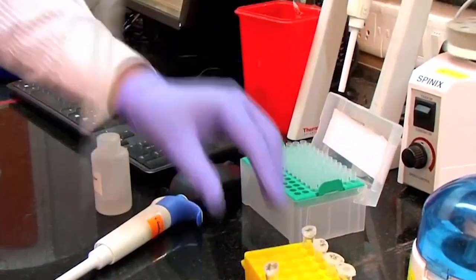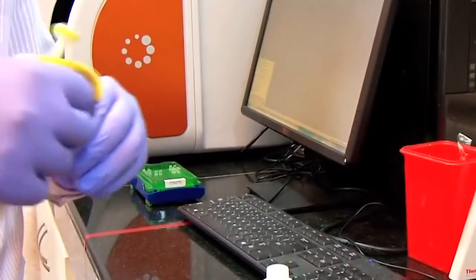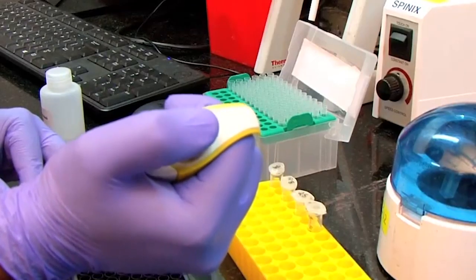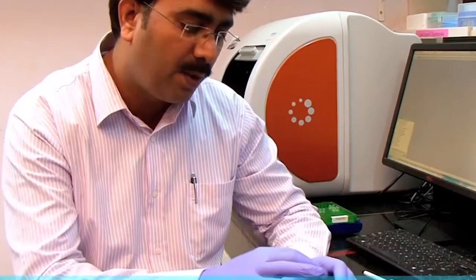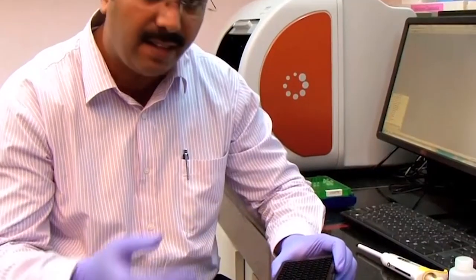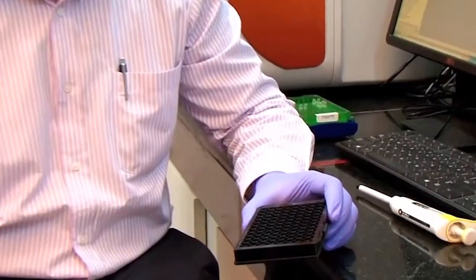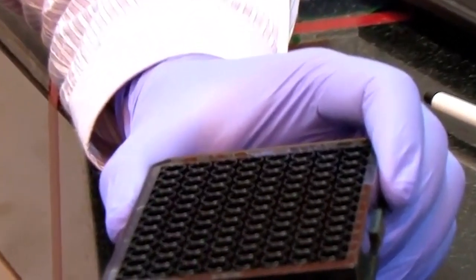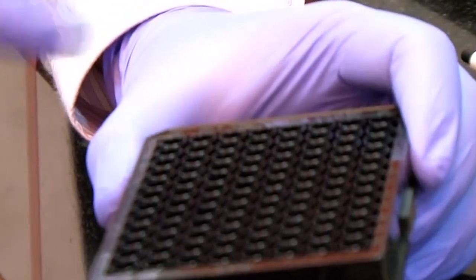Here, this is the 50 microgram per ml protein. I'm serially diluting, doing a 2-fold dilution in the plate. So now we have made 6 concentrations of the standard apolipoprotein, ranging from 1.56 to 50 microgram per ml. I put these standards from 1.56 in A3 until A8, which is the last, 50 microgram per ml. I also put a reference buffer, which we use for the reference subtraction, at B6, B7 and B8.